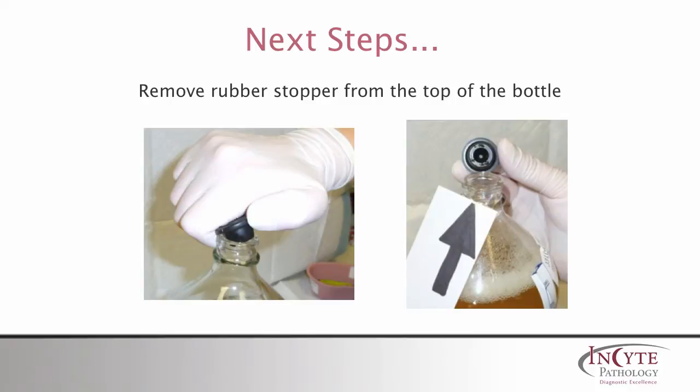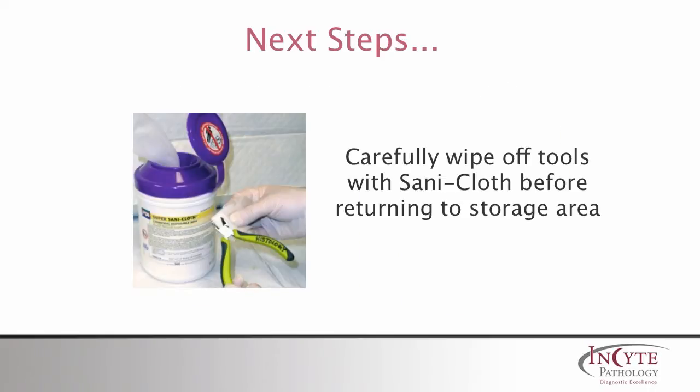Now slowly and carefully remove the rubber stopper using your thumb to lift the lip. Be sure to carefully clean the tools used with disinfectant — here we are using a sanitizing cloth before returning tools to our storage area.